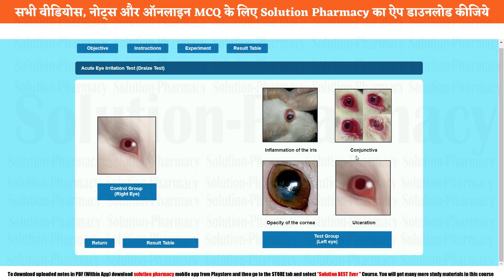What are the possible observations? First is inflammation of the iris — as you can see, there is slight inflammation of the iris, which is possible if the drug is toxic to the eyes. Second is conjunctiva — inflammation, redness, and pink eye on the rabbit. Next is opacity of the cornea — at the bottom of the eye, there is some opacity and a translucent appearance, which may be a toxic effect of the applied drug. Finally, ulceration — there are some dots and an erosion-like appearance, which is also a toxic effect of the drug applied on the left eye of the rabbit.